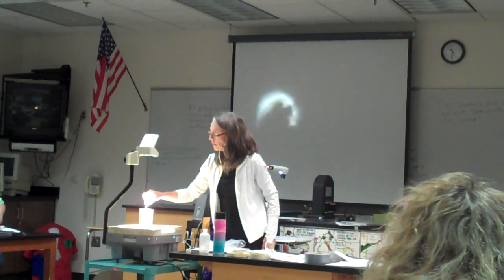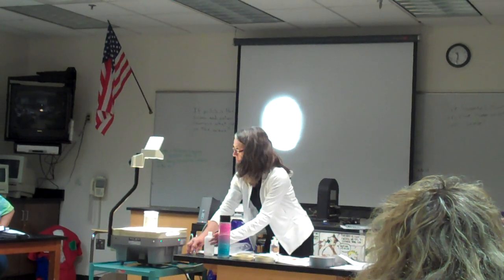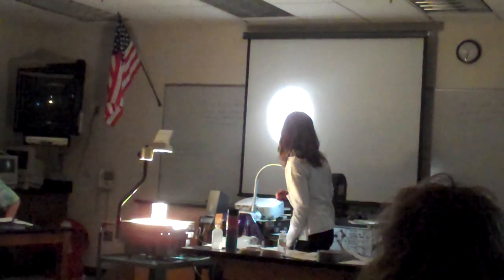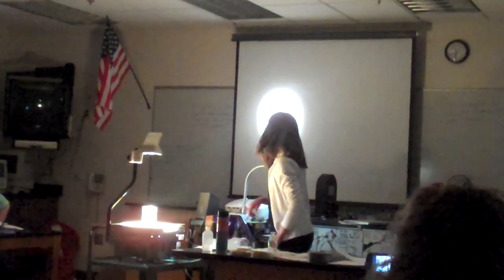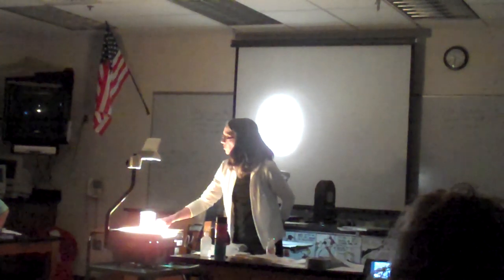Would you turn off the room lights? And what you want to do is watch the side of the beaker and the light that comes up through the top of the beaker and goes to the screen. Oh, there's still some crystals. Now, it's already looking blue to me. A little bit on the screen, but more where you're going to see the blue is here.